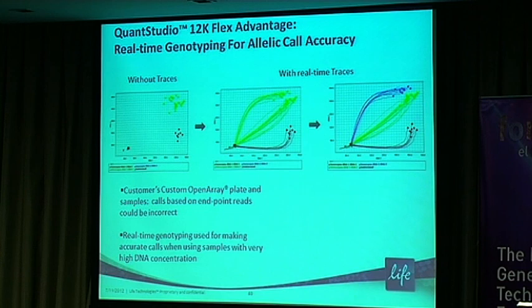A lot of different assays perform optimally at different PCR cycles. Some have to go all the way to 50. So what this new software allows you to do is run it once, do 50 cycles on all of your different SNP assays, and then instead of physically going back and reproducing the data, all you're doing is marching backwards in the software itself because the data was already collected.